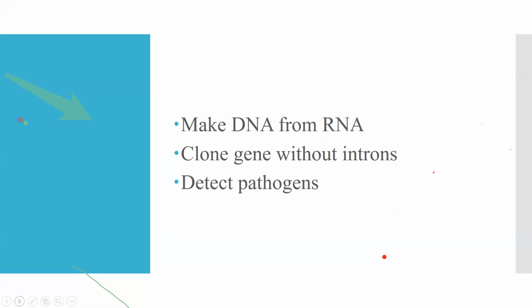Here you take the virus, extract the nucleic acid, apply a reverse transcription step, and once you are done with the reverse transcription step, you have complementary DNA. That DNA can again be amplified using traditional PCR. Then that will help you to detect pathogens. And you are seeing on the televisions that every day we are getting around 3.5 lakh to 4 lakh infections. Most of them are detected by using these very technologies.